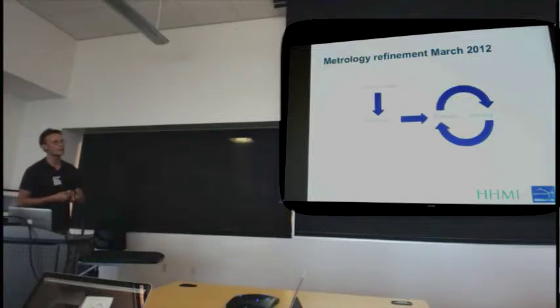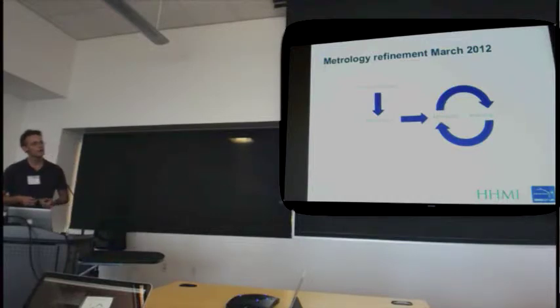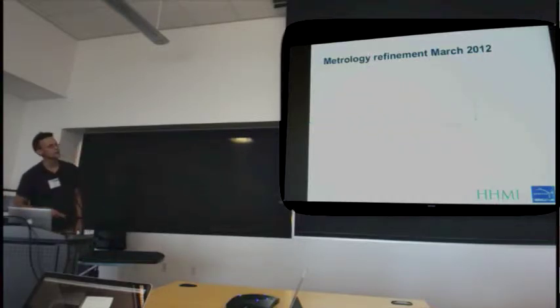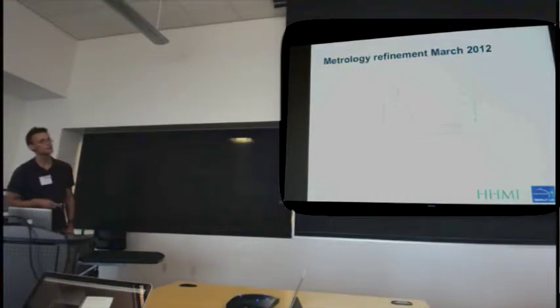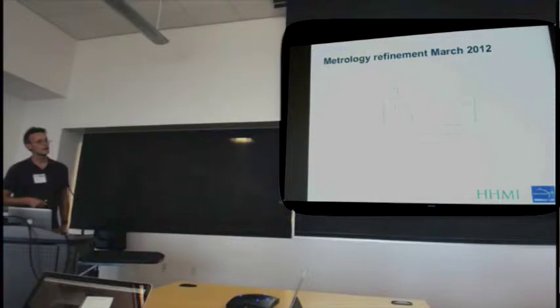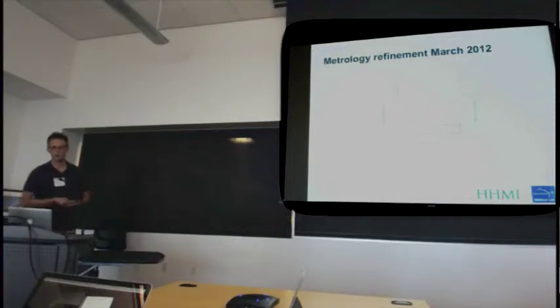So what we can hope to arrive at using this approach is a fixed point, where stuff doesn't change anymore, no matter how much we cycle. And then hope that that particular fixed point actually corresponds to the solution we're after. And it turned out that it converges pretty fast. This is one of the very first plots where the translational correction is shown in red, in pixels, and rotational correction in green. You can see that after just a handful of iterations, we're at the point where we can't really improve it much.